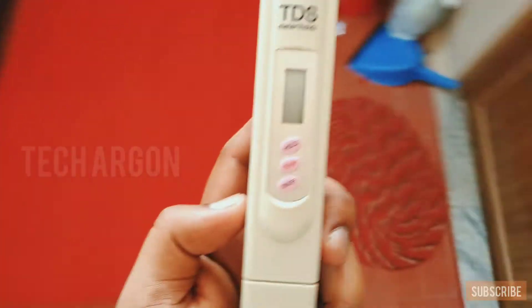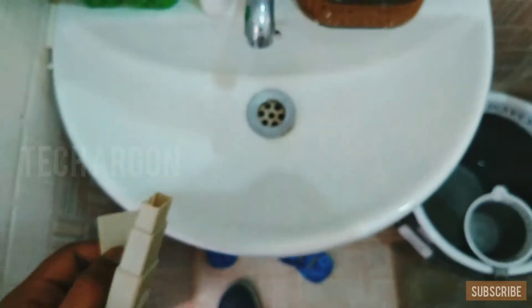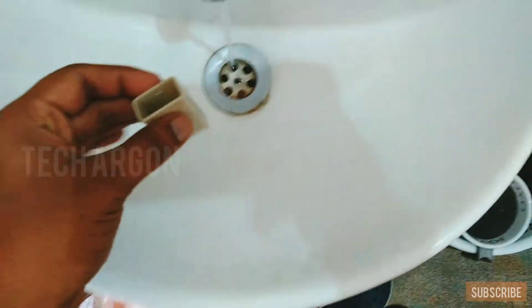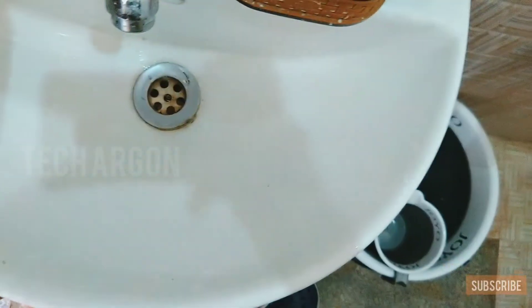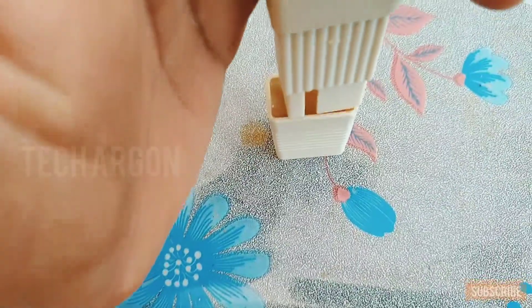For testing the TDS, whichever water you plan to purify — I have a tap here and I want to know the TDS of this water. Open the pipe and collect a bit of water in the cap they have provided. After that, turn on the TDS meter and dip it in the water.